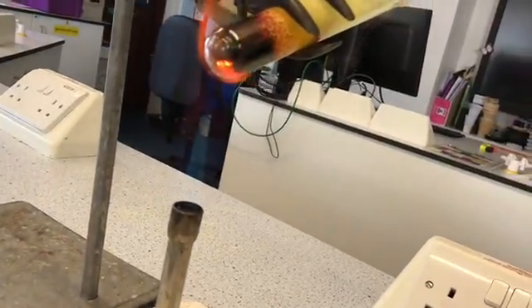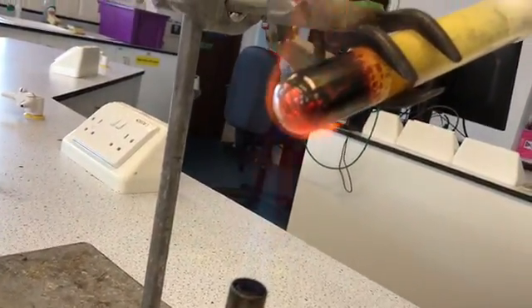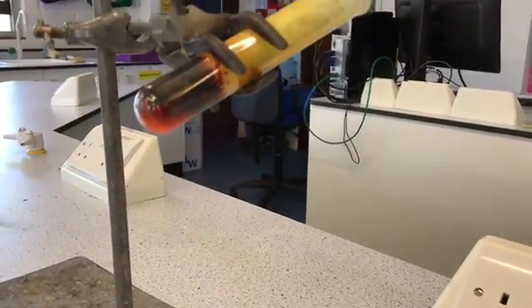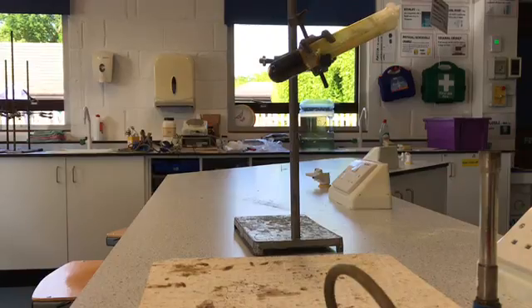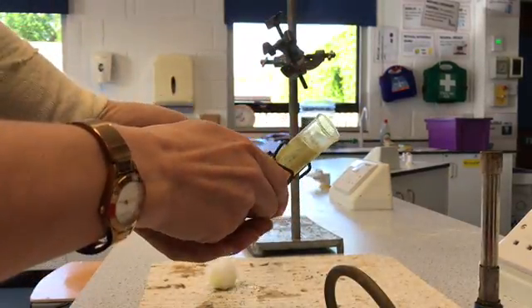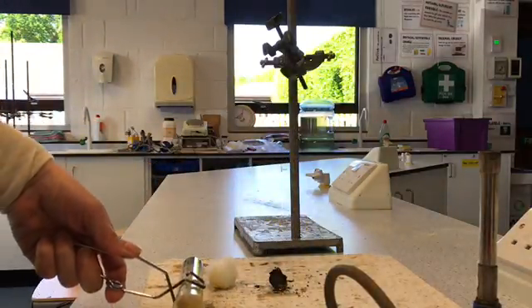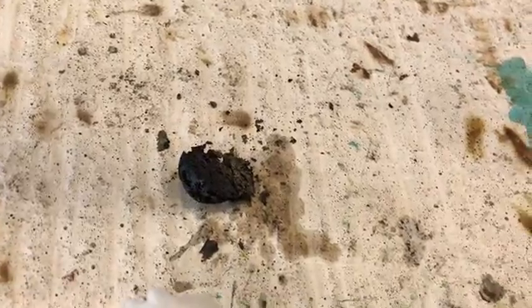You can see the red glow as the compound starts to form. After letting this cool down a little bit, we're now ready to get our compound out of the boiling tube. Using some tongs we take out the cotton wool — that stinks — and then tap quite hard to get the compound out. This is the compound that we've made.